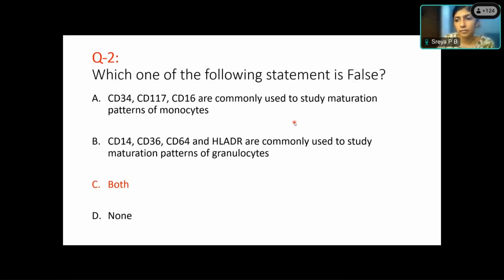See, there are two things. First you study normal maturation from healthy individuals or staging bone marrow. Then, because of that, you can see deviation, so you study well-established cases of CMML, and you study what the difference is and how reproducible it is.